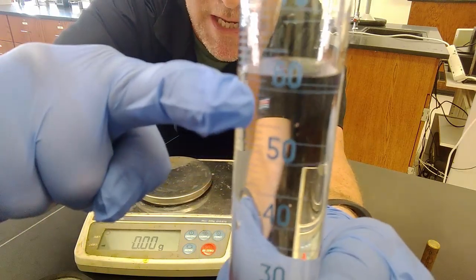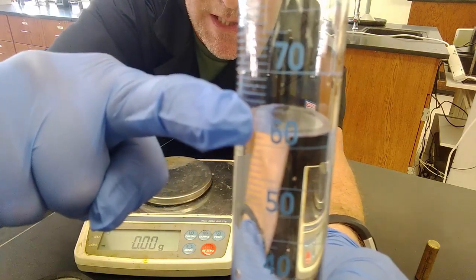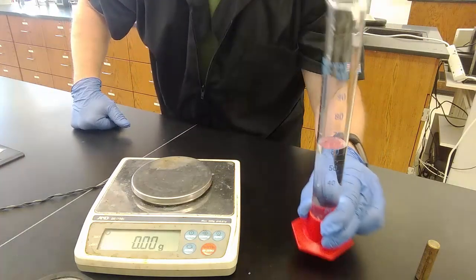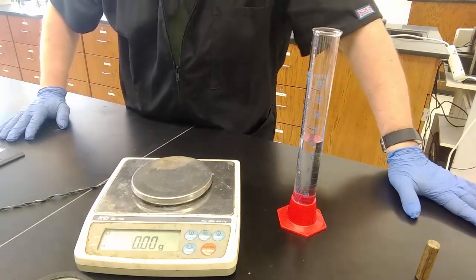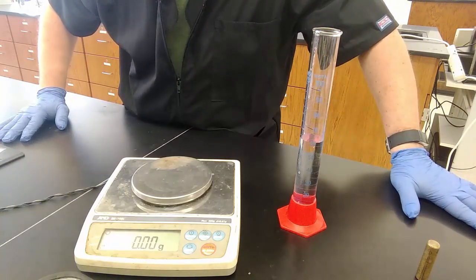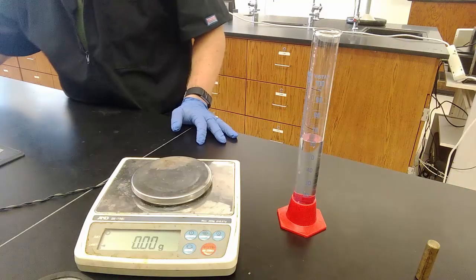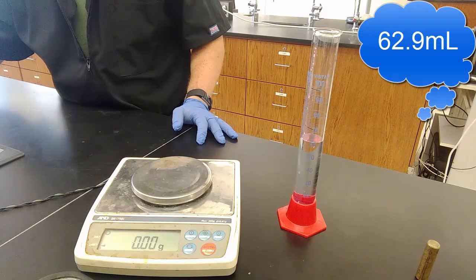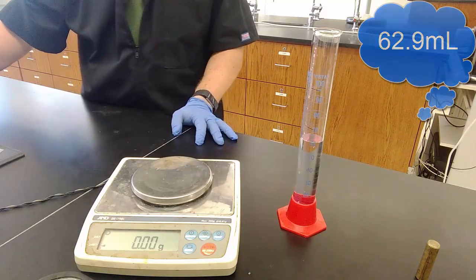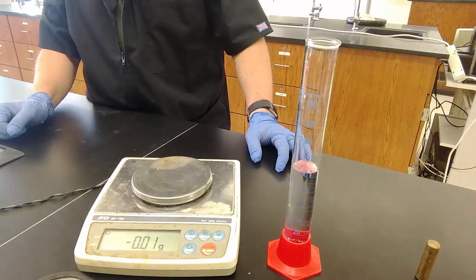All right, this is marked in 1 milliliter increments. So I know that it's between 62 and 63, but really close to 63. And so that's what I have to write down. Well, what am I going to write on my data sheet? Really close to 63? No. I am going to estimate that last digit. I'm going to write down 62.9 milliliters. Now, you don't have to write this number down because you'll be supplied some sample data, but 62.9 milliliters is my volume without the bar.